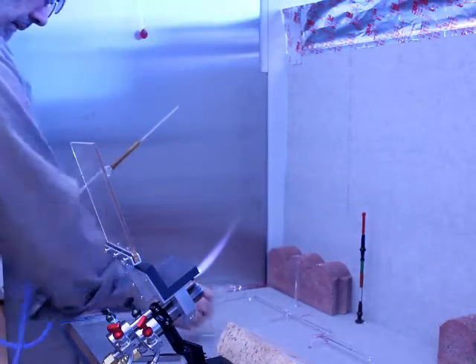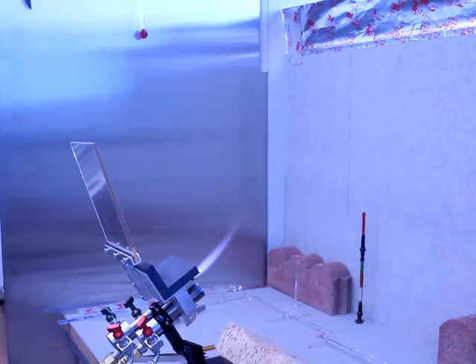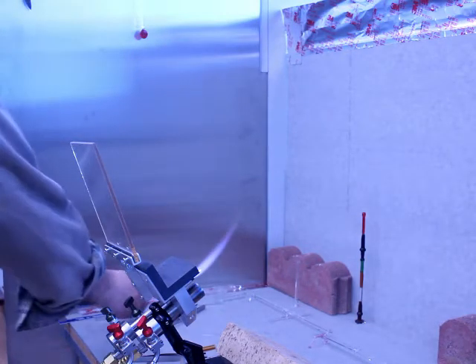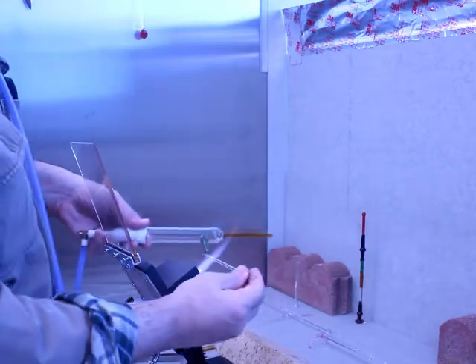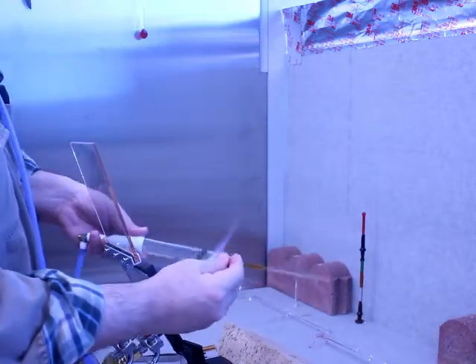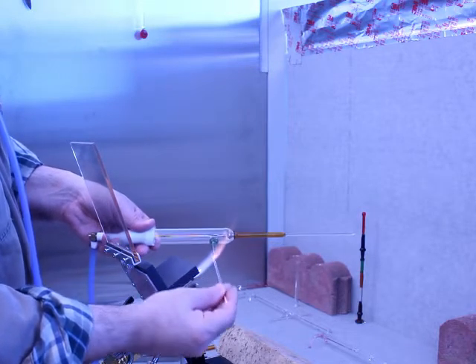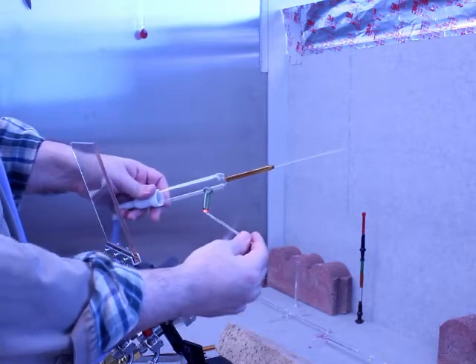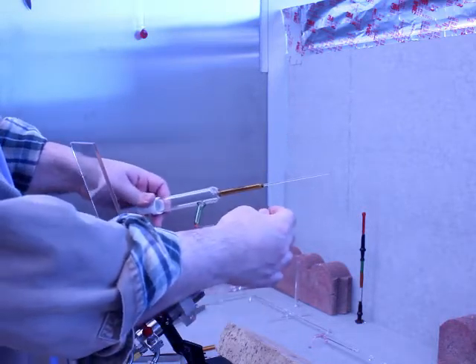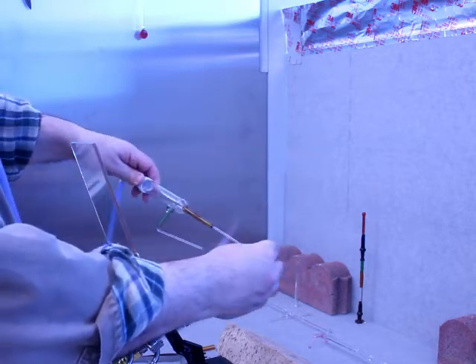Okay, so I am going to make my bridge now. And there it is. This is 3mm. So I make a hot seal here. Okay. And actually that's a good angle. I don't have to make another bend. Give that a moment to settle.